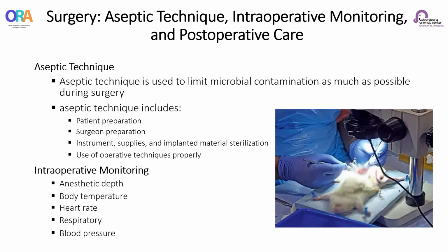It is an important thing. When sterilizing instruments and other materials to be used for surgery, sterilization indicators should be used to validate proper sterilization. Some alternative methods, such as hot bead sterilizers used for batches of rodent surgeries, are appropriate. Okay.